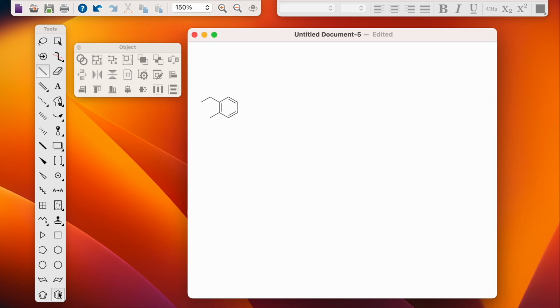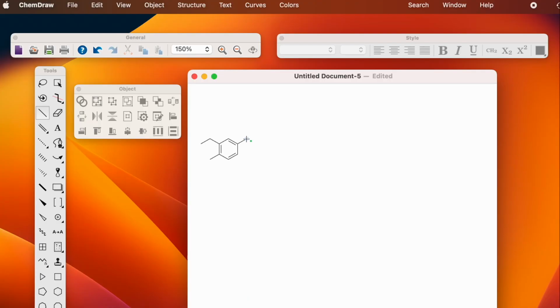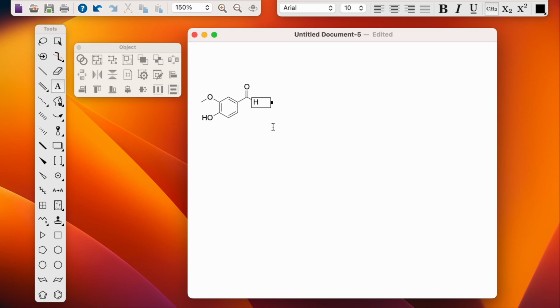If you'll notice, I selected the benzene ring down at the bottom of the toolbar. There's a benzene ring. I could just draw a benzene ring instead of drawing a cyclohexane and having to add double bonds to it. And I'm clicking on atoms to get some nice angles all spaced out there. If I click on an atom, I can change it to something else. If I write OH, then if it's on the left side of the molecule, it'll automatically change to look like HO, making the oxygen attached to the benzene ring because the hydrogen is not attached in that case.